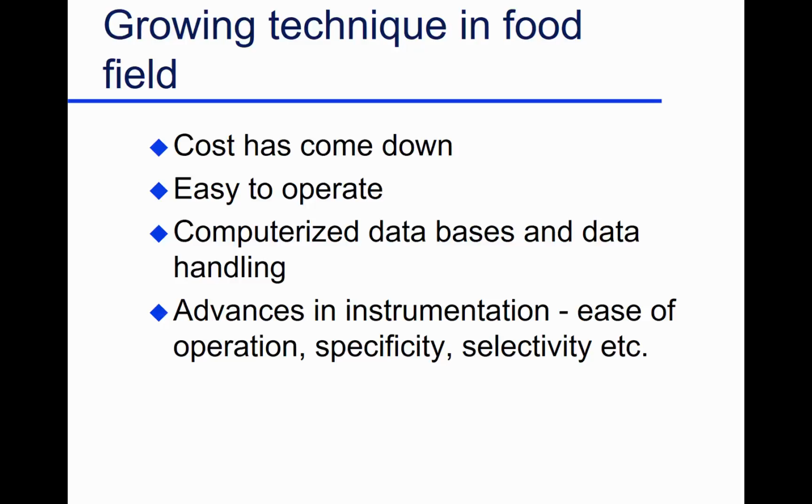Cost has come down. Actually, I've operated the mass spectrometer for 3 years. That's what I got paid for at Penn State when I was doing my doctorate degree. And of course, the thing was massive, as you might imagine. Now you can't quite put it in your pocket, but darn near. But massive, and the cost was equally massive. Cost has really come down. They're easy to operate. They are turnkey systems.